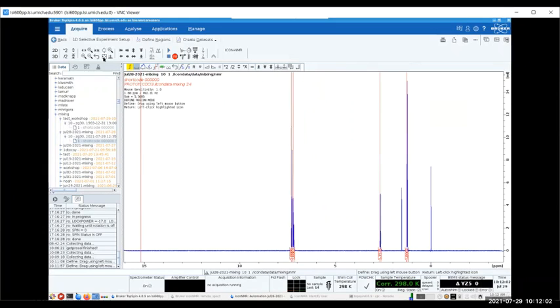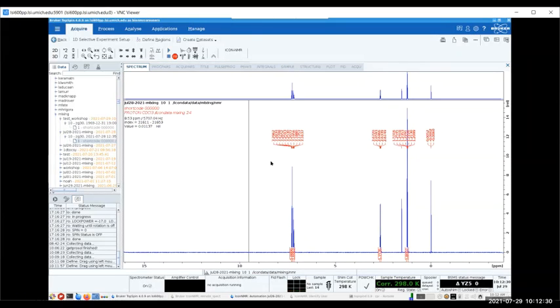So now if I go to the full spectrum, you see there are 4 integrations showing up. So I define 4 regions. Now I can go to this save and export region, and I'll save region to REG. So I'll click on that, and then maybe I want to save this region to the spectrum again. So I will just click on return save region. Okay, so now this integration and this region I defined here are those 4 that I'm interested in.